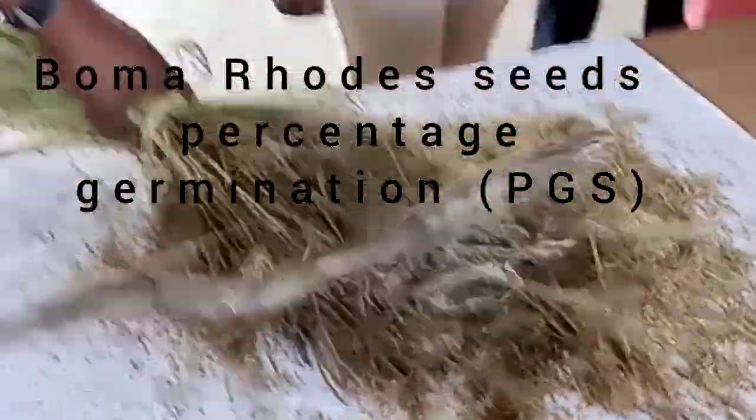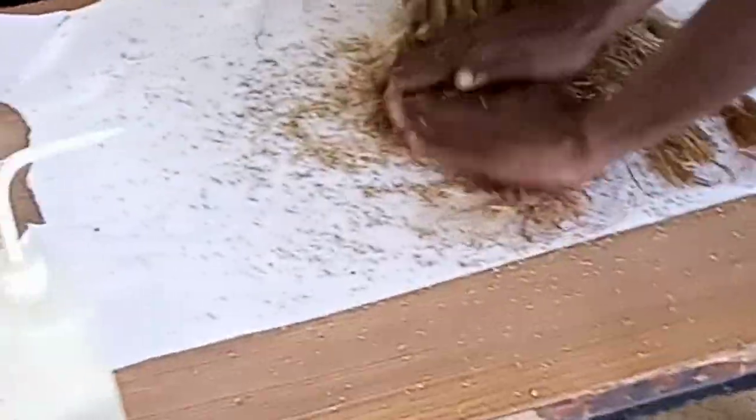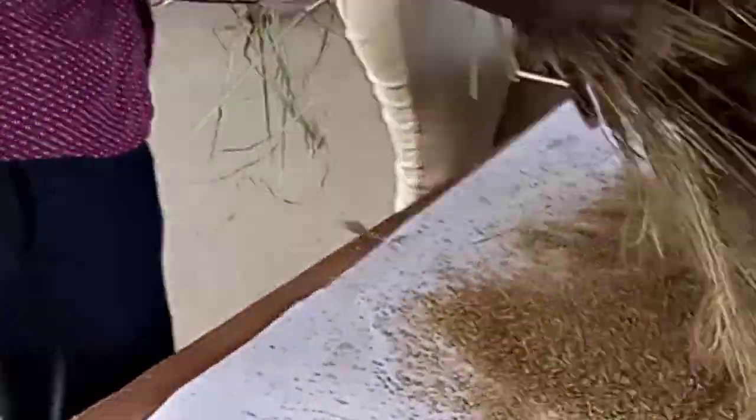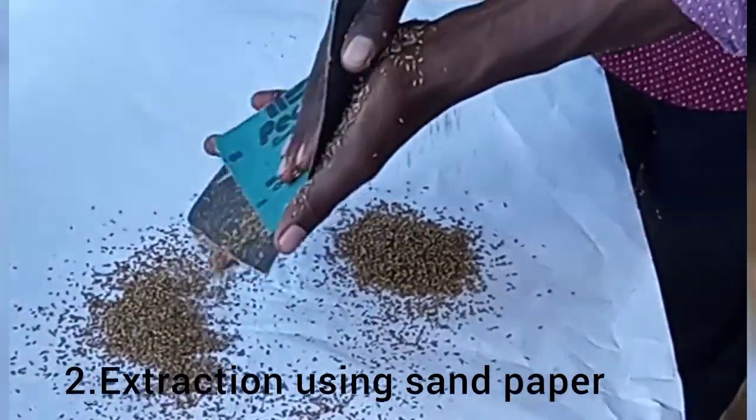Boma Rhodes percentage germination. Step one is threshing of the seeds. Then after threshing, you do extraction using a sandpaper.